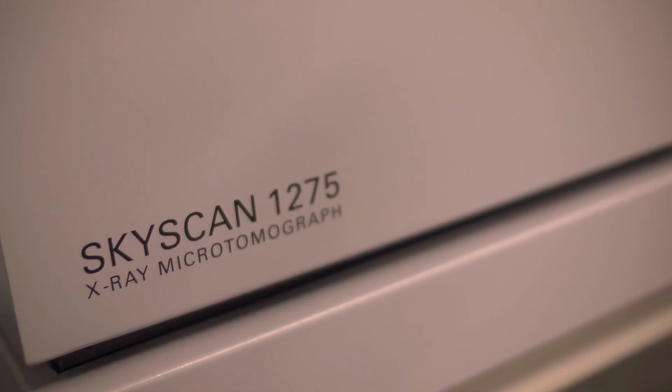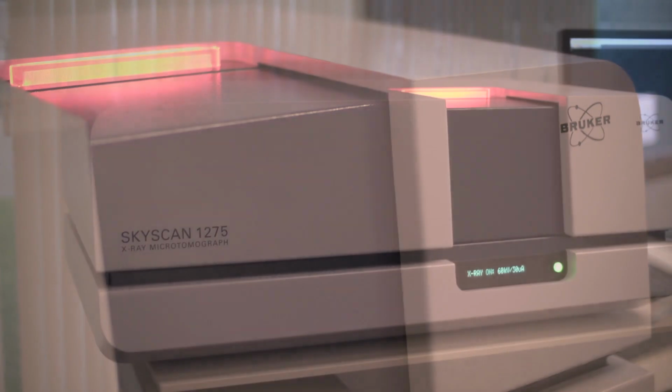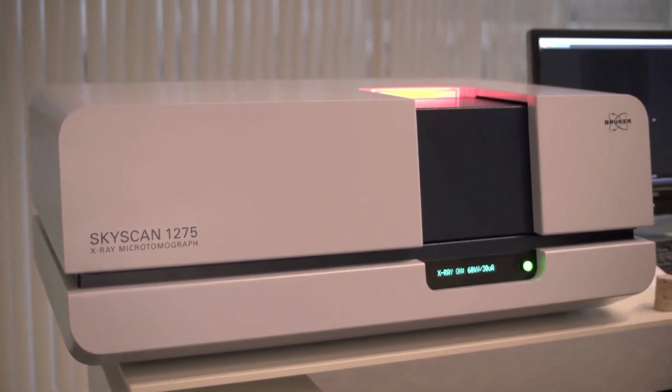I'm the Applications Manager for Bruker Microscopy, and today I will be discussing our latest development, the SKYSCAN 1275, which is the very fast and very user-friendly micro-CT system.